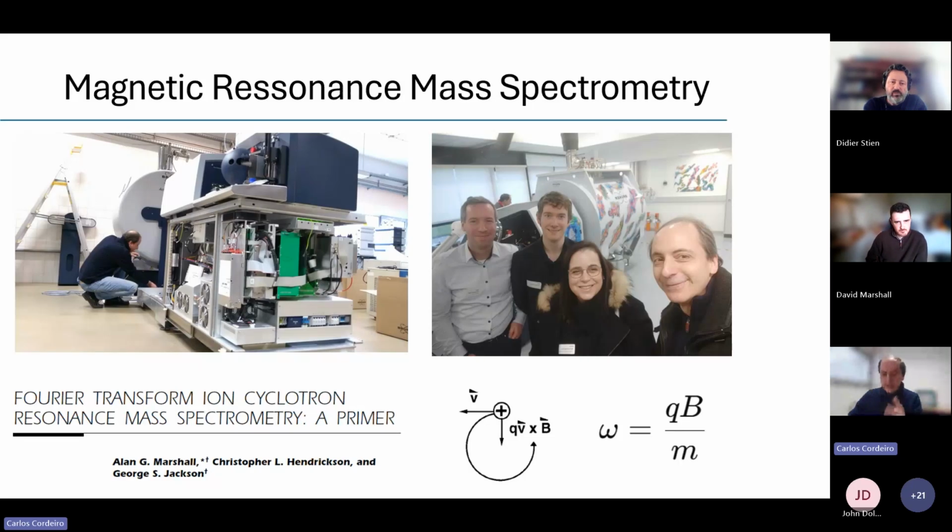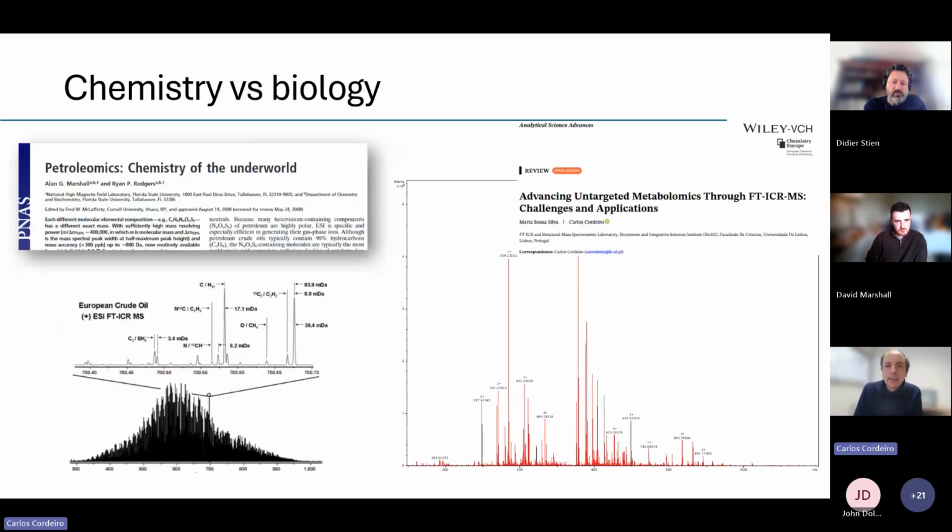So what these instruments allow us to do is to have a very, very extreme resolution. This allows us to deal with very complex mixtures without actually using separative techniques. For example, on the left, you have a sample from crude oil, and crude oil can contain up to 400,000 different components. So this is not feature level, this is identifiable formulas. And just zooming in, you can see there's a lot of detail in the spectrum. So this would be the most complex type of samples that are dealt with.